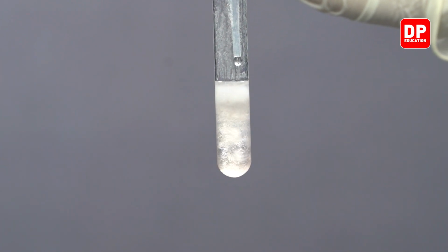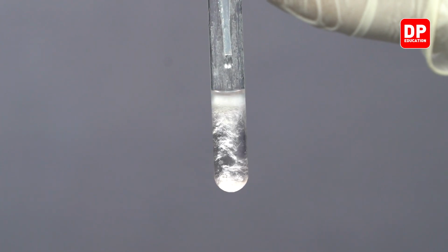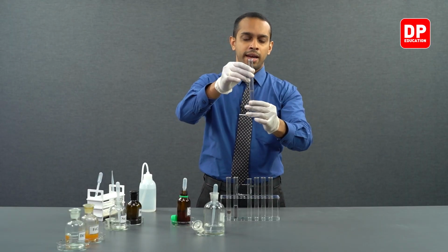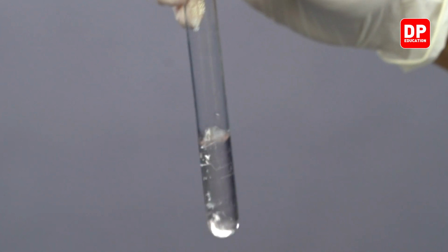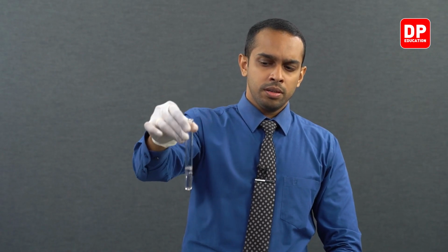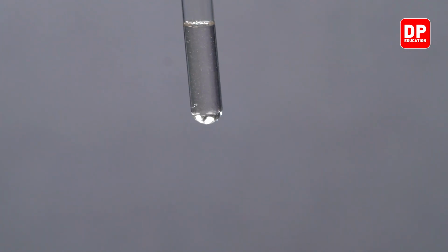As you can see, when sodium hydroxide is added little by little, the cloudy nature of the phenol solution disappears and it forms a clear solution. Now, if you mix it really well, you can see the phenol completely dissolves in sodium hydroxide and forms a clear solution.